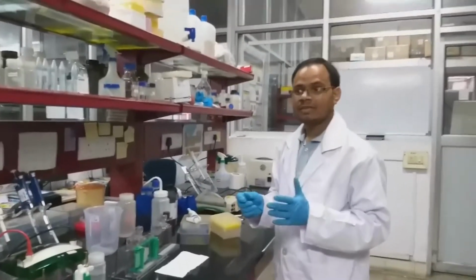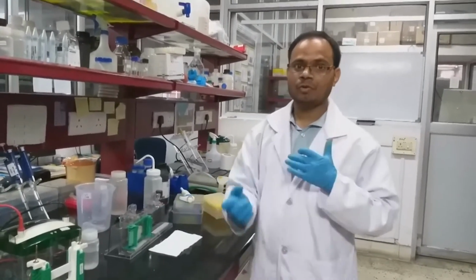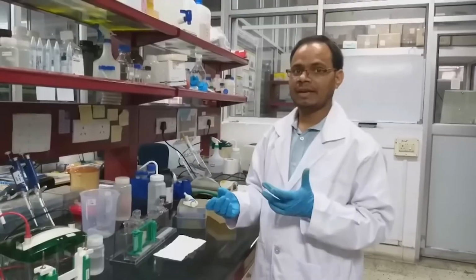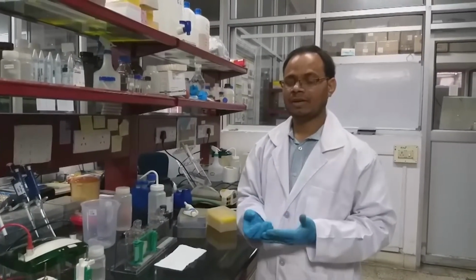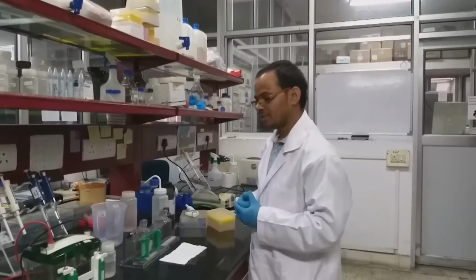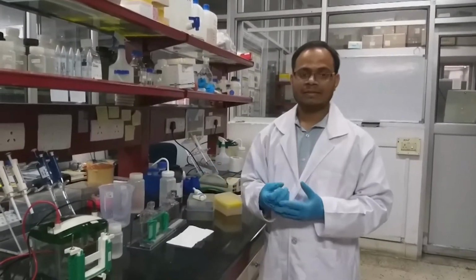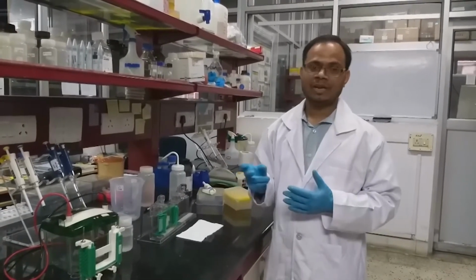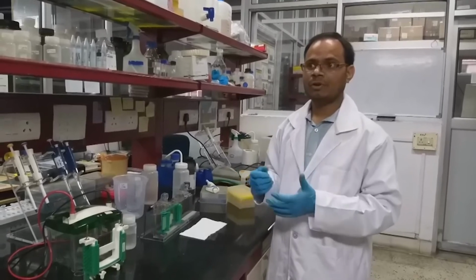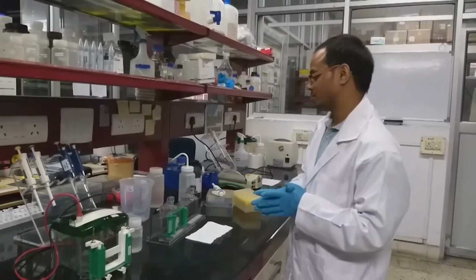So after this, on the top layer, we have to overlay with some solvent like 2-butanol or isopropanol or with water. So why are we doing this? Because if the gel is exposed to air, then the oxygen from the air will interfere in the polymerization of the gel. So we have to add either water or 2-butanol for this purpose.